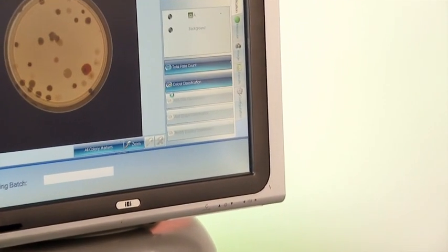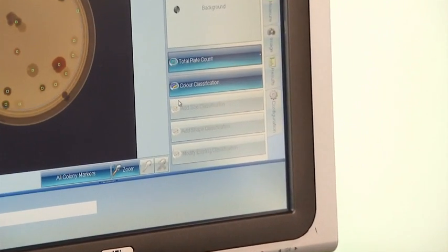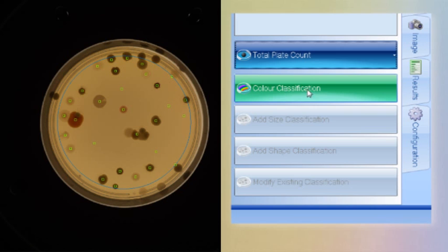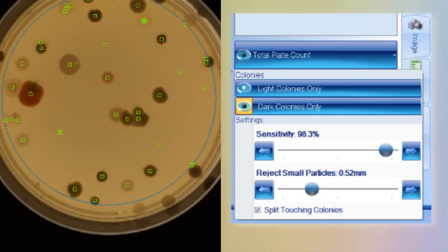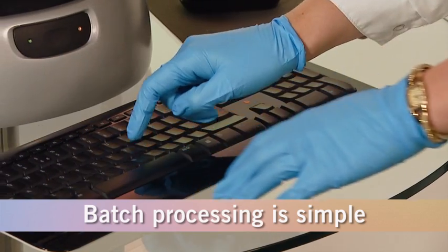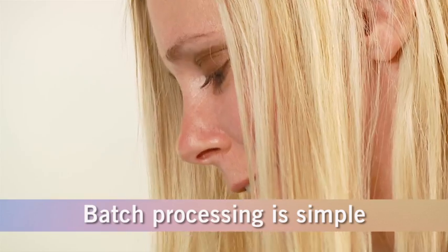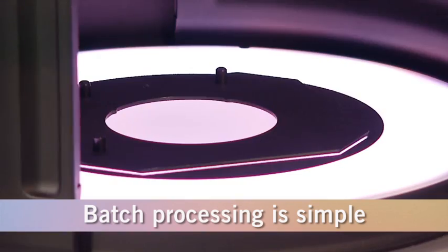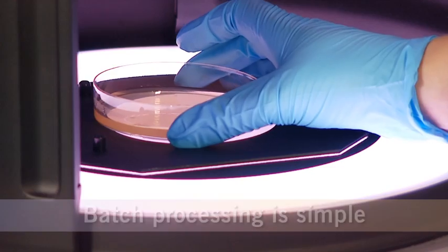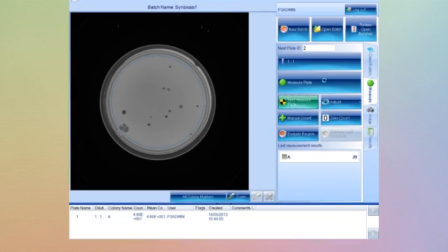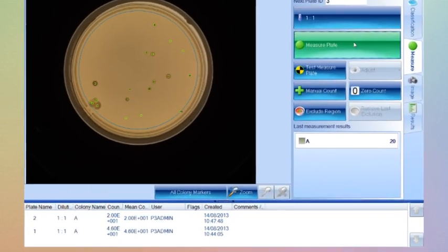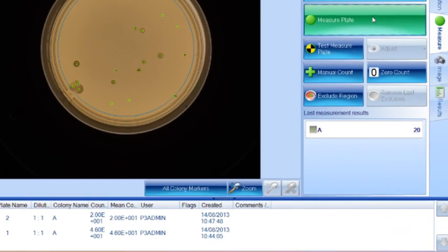Batches are created and parameters are set by adjusting colony sensitivity and checking the splitting function to separate touching colonies. Once the parameters are set, batch processing of colony counting is simple and ensures high throughput.